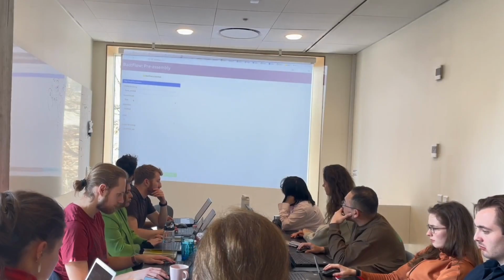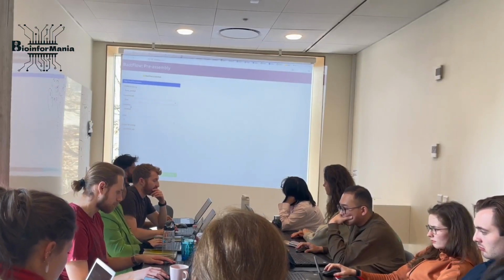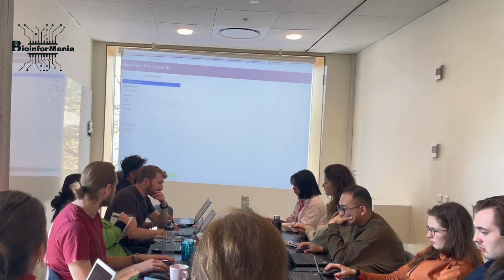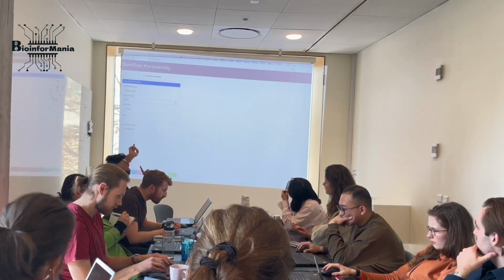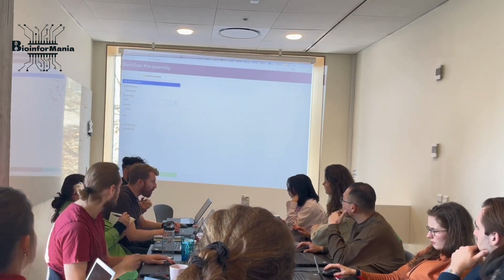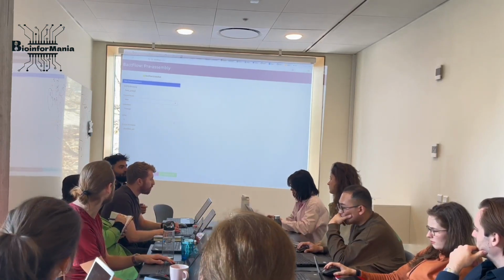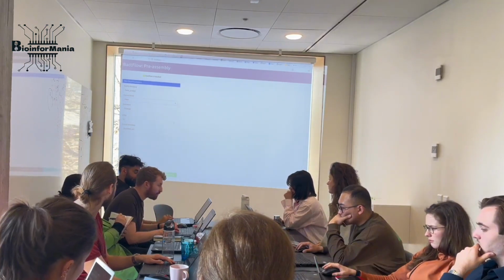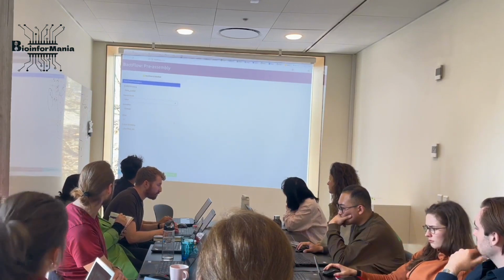So it's asking you, do you want to concatenate the reads? We set it to false because these reads have already been pulled together. Inside this fastq pulled folder, you have one fastq file per sample, per genome. But in some cases, per genome, per barcode, you have a lot of different fastq files, which you need to pull together. Okay? If you are in that scenario, you need to set that to true.